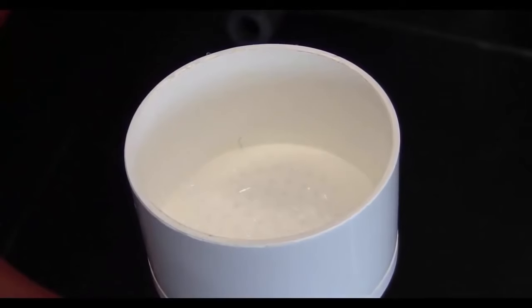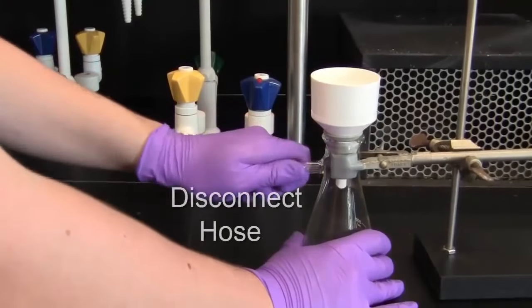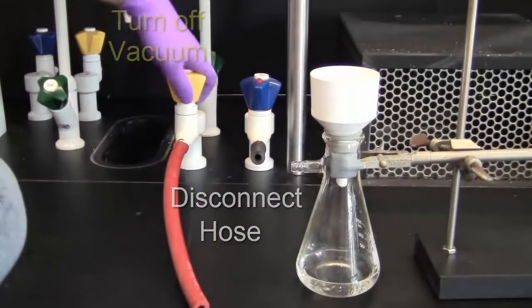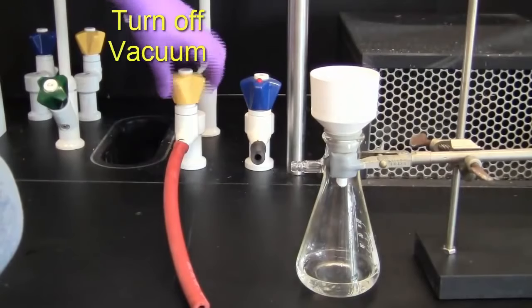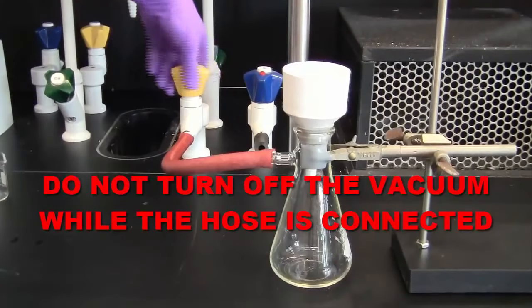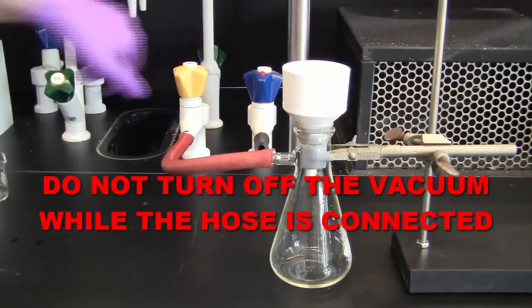After the solid has been separated from the solution, disconnect the vacuum hose first and then turn off the vacuum valve. This prevents solution from back washing into the vacuum system.